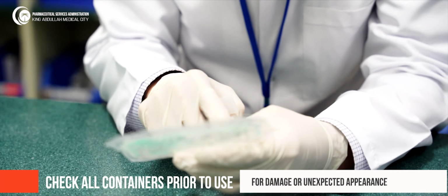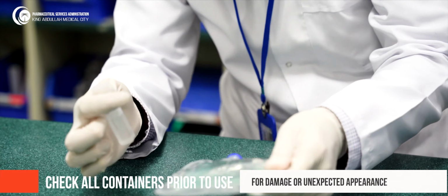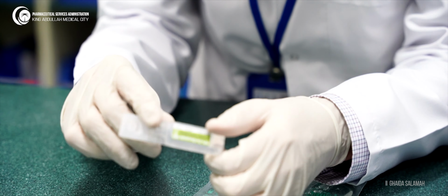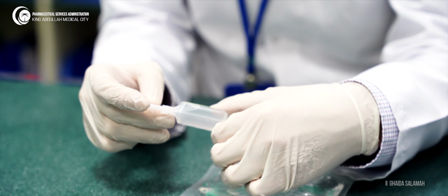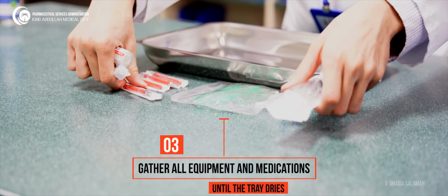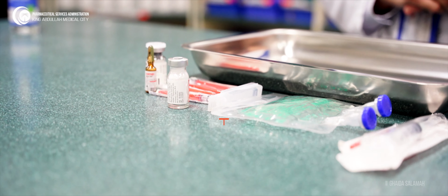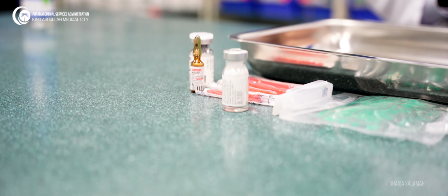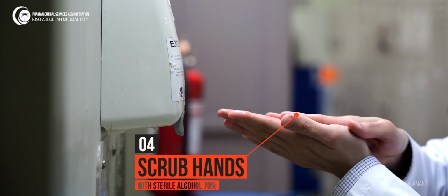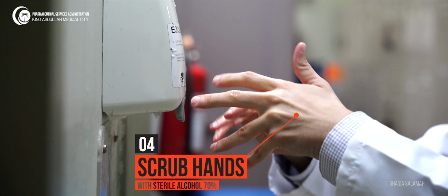You will collect all containers and check the expiry, and check for any discoloration or particles in the medication and the bags before preparation. Then collect all needed equipment: syringes, needles, vials, all needed equipment for the preparation. Then you will scrub your hands with sterile alcohol 70%, with the same steps as hand washing.